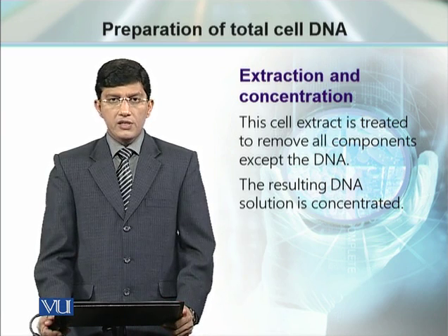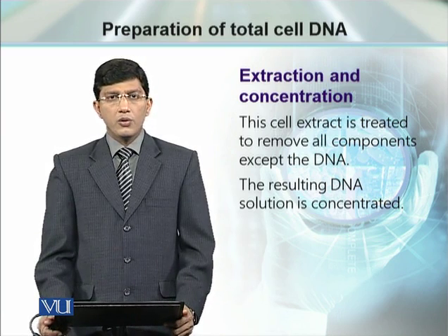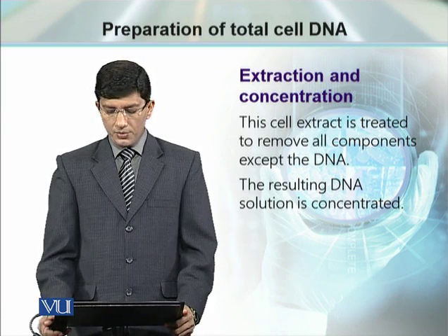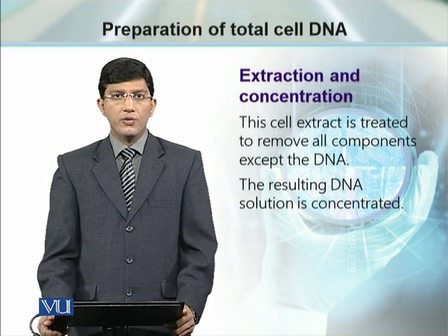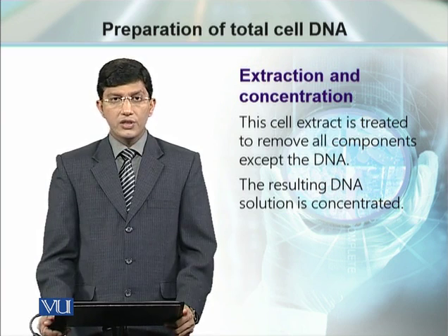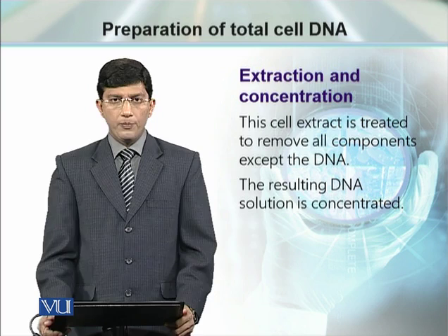The treated cells or the ruptured cells are going to be processed further so as to remove all the components except the DNA. Once we isolate the DNA from the rest of the debris, cellular debris or any cellular components, we can further concentrate it and we can obtain the purified DNA.